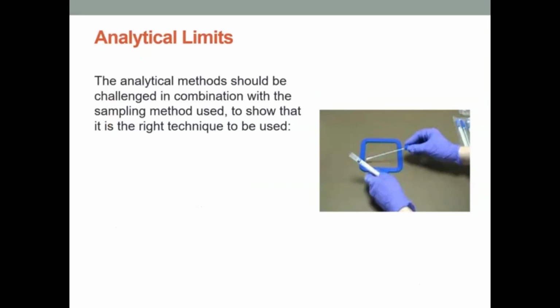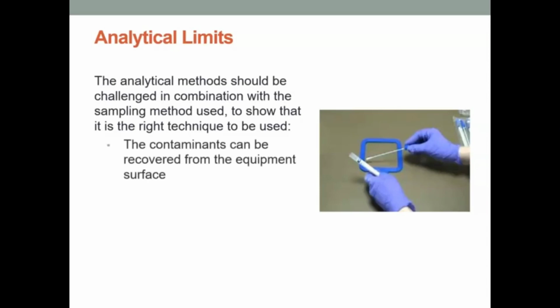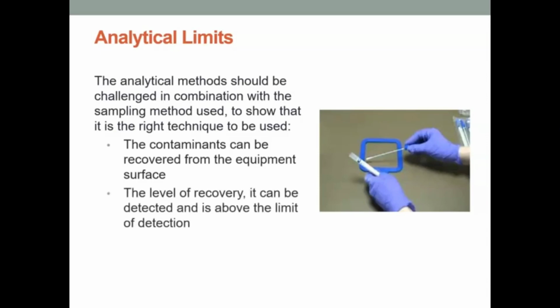The analytical methods must be challenged in combination with the sampling method, so you need to know that your analytical methods work and also that your sampling method is recovering any residues that may be present. The contaminants can be recovered from the equipment surface, and the level of recovery can be detected and is above the limit of detection of the analytical method that you have chosen. There also needs to be consistency of recovery.